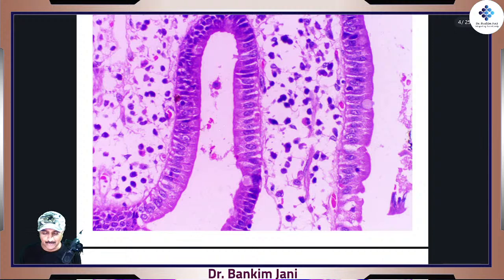Can there be any doubt that these nuclei are elongated? They are the basal nuclei. There is so much cytoplasm. No doubt about it. Right? And this is our lumen. This tells that the inner lining of the digestive system is thrown into so many folds. Why folds? So that it increases the surface area, because this is the area where there will be absorption, right? We talked about it yesterday, because these are the cells which will be taking care of it.